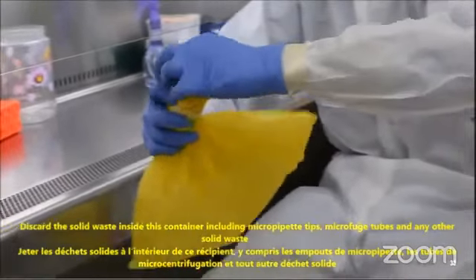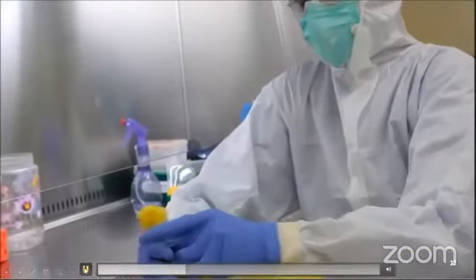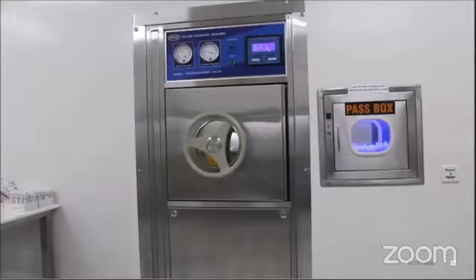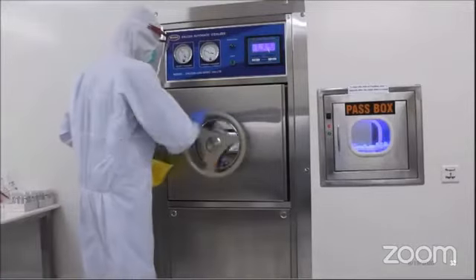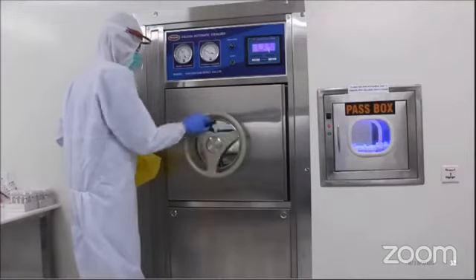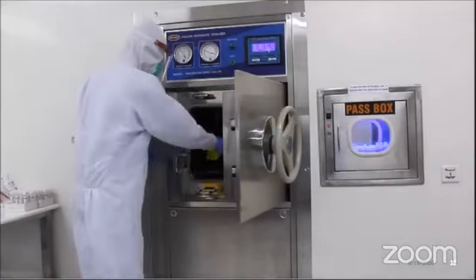No sharp items should be placed inside this bag because they will puncture the bag. Make the gooseneck and put it in the autoclave. And after autoclave, it will go for incineration.